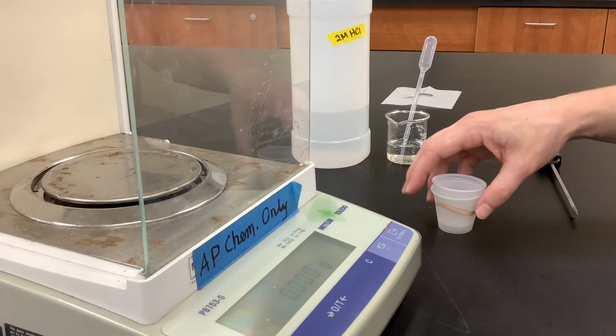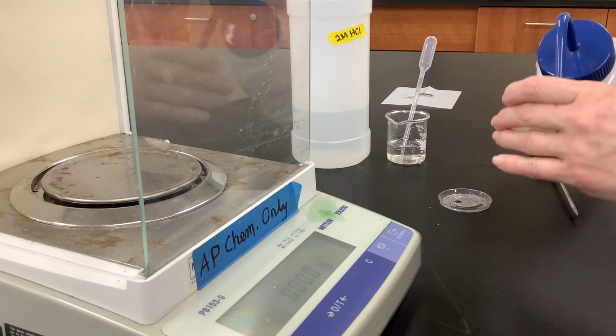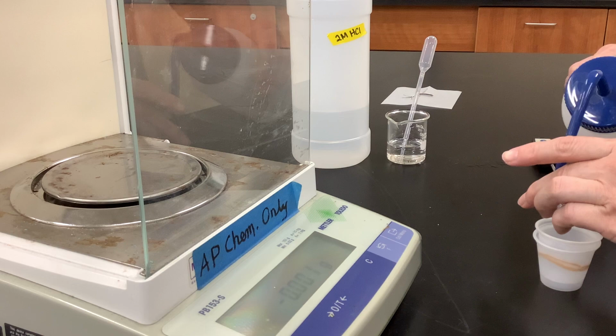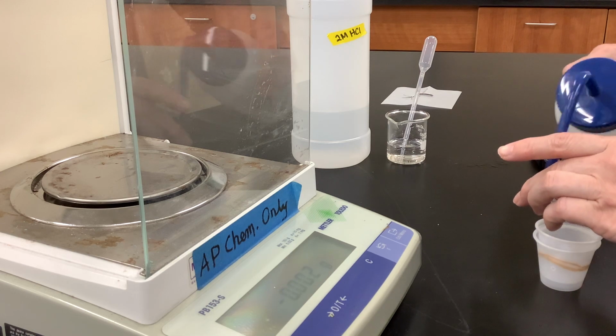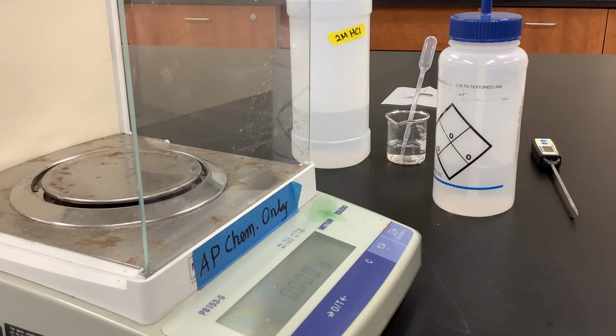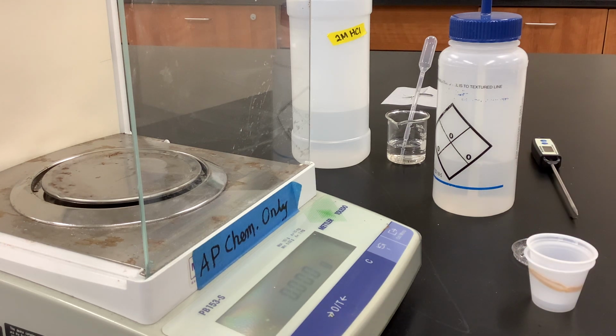So, okay, rinse down our container, okay, rinse down the surface like we've done. Okay. Right, dump it into the waste container. I have it off screen, sorry. And then what we're going to do is we're going to dry the container.